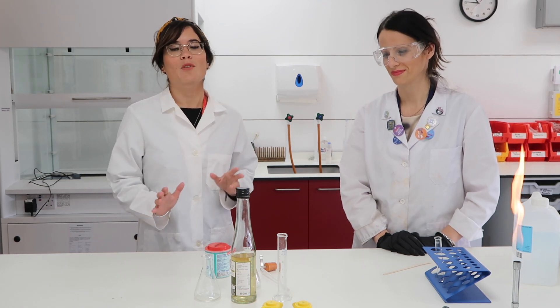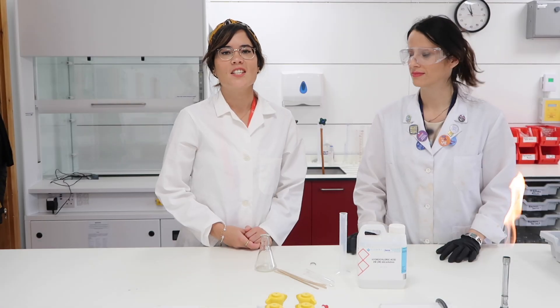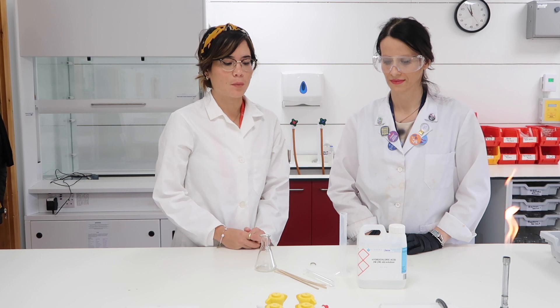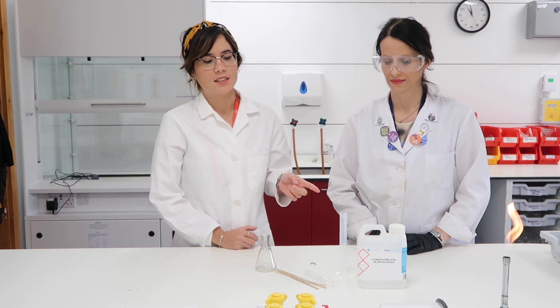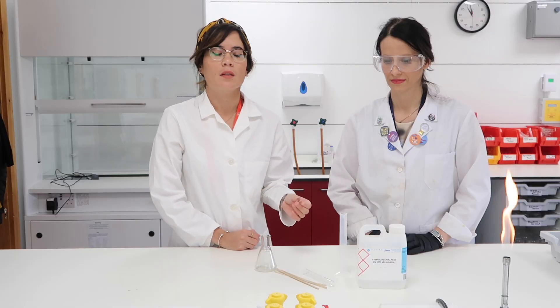I'm super excited because we're bringing Science with Hazel to the laboratory. In this video, Amelia and I are going to show you how you test for the presence of hydrogen gas. To produce hydrogen gas, we're simply going to be reacting hydrochloric acid with magnesium ribbon.